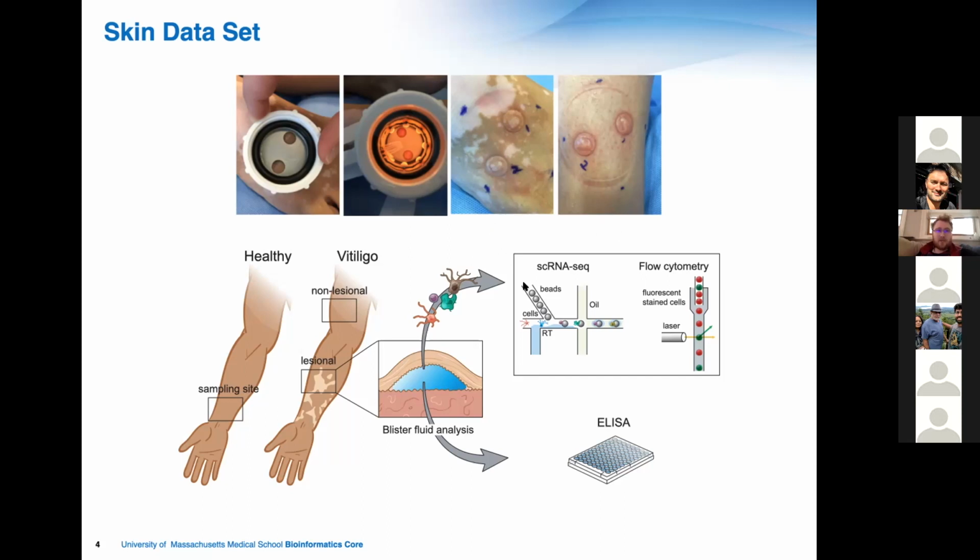So when you're working with the skin data set, feel free to try different parameters, do things other than exactly what's written here. Because in the end, you're going to be the one who tells us what's going on with this data. And there's not necessarily a right or wrong answer, but there are some answers that are definitely closer to what the biology would be than others.